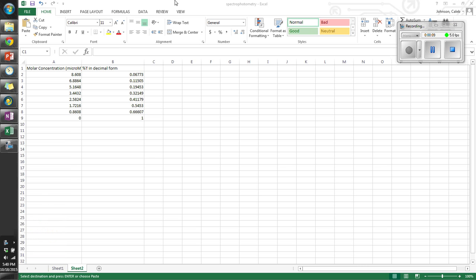You had a request to make a video for how we're supposed to graph in Excel our spectrophotometry data. So I'm sorry it took me so long to get around to this, but here's the gist.